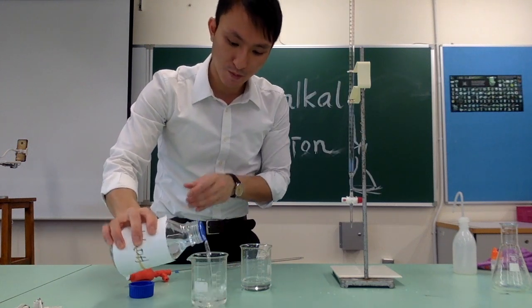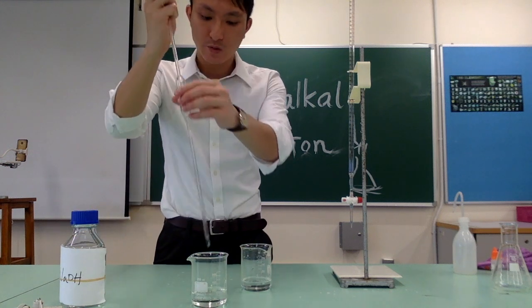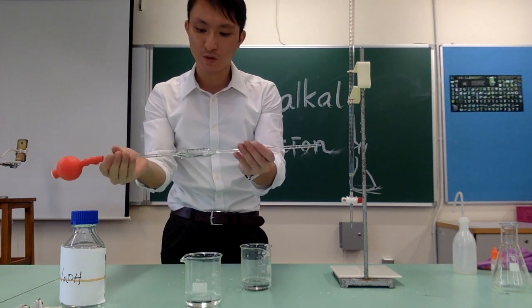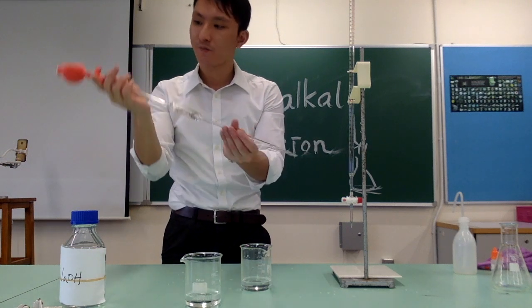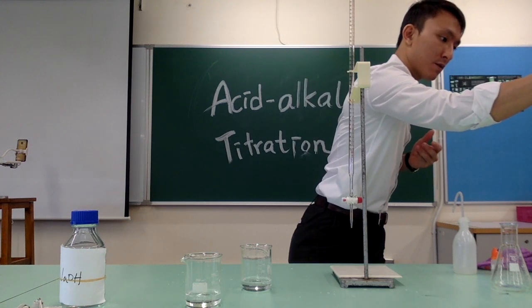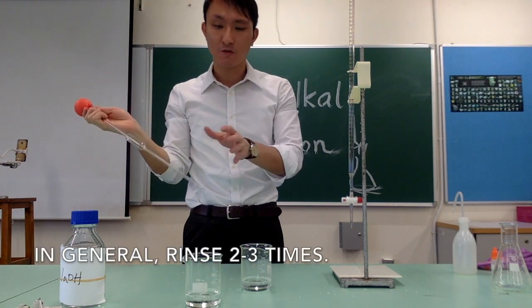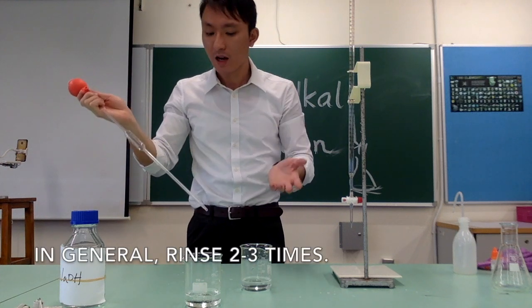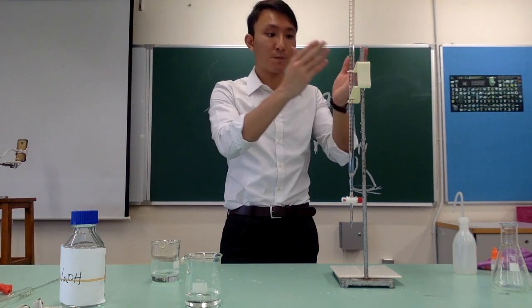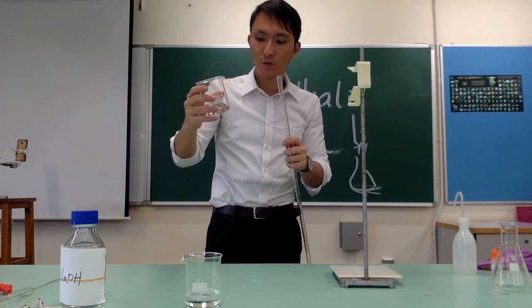Now we rinse the pipette with the solution it will contain — in this case, sodium hydroxide. Add a little sodium hydroxide into a beaker, pour away the first washing, then add a fresh amount and rinse again. In general, we do the rinsing two to three times, but for time's sake I only do it once. Next, let's clean the burette using distilled water — make sure the valve is closed and pour some in.